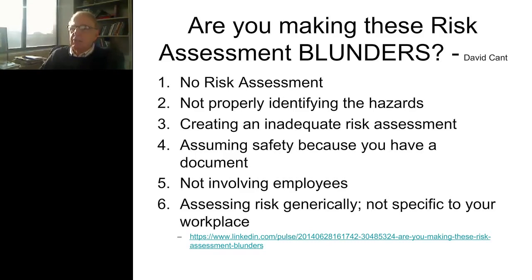Not involving your employees. All the staff need to know what's expected of them and why it's expected of them. And another blunder is assessing risk generically, not looking at your specific workplace. You have to craft your risk assessment process for your particular work environment.